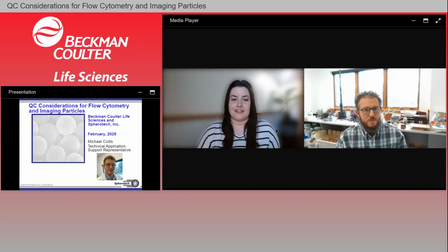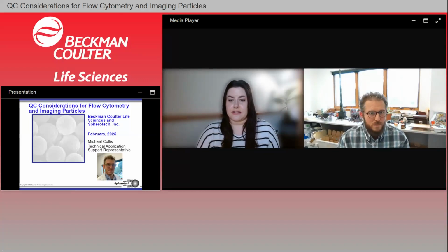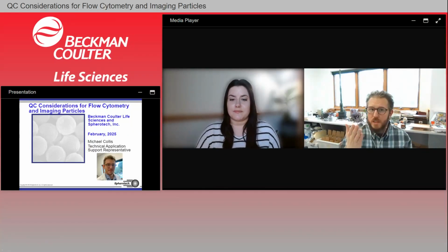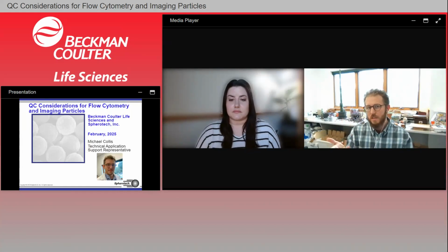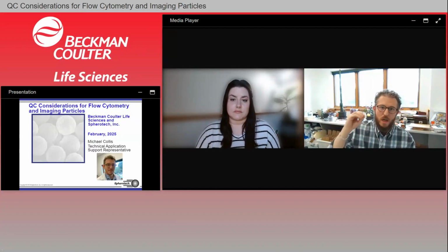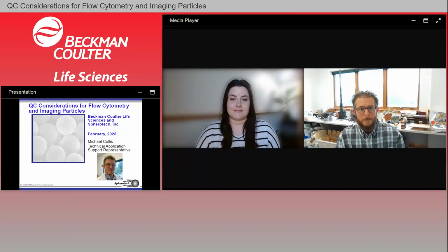Great, thank you. All right, our next question here says, what medium do you recommend for dilution? The about 2 drops in 2 milliliters as presented earlier. MilliQ. You could use your sheath fluid, but on a lot of these Coulter cytometers on the life science side, they're going to be using MilliQ DI water. You could use a little bit of BSA or sheath fluid, like I said, but usually I am just using DI water, MilliQ. Great, thank you.